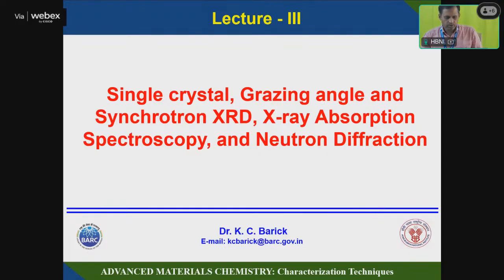Good afternoon. So in the last class we discussed X-ray diffraction techniques and how we can prepare the analysis of the X-ray pattern, and all the details from the source to the detector, all those parts we discussed. So today we'll discuss a few other XRD-based techniques, X-ray based techniques, and if time permits, I'll also discuss neutron diffraction.